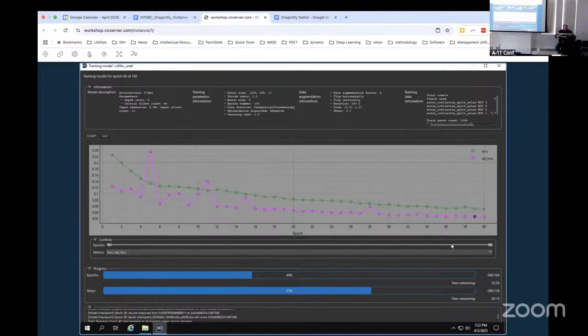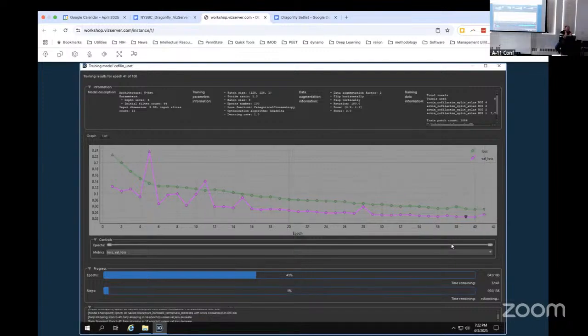Yeah, it's hard. The only time I ever close in the missing wedge is with our vesicles. Sometimes we'll close in a whole vesicle because it trains well enough to somehow distinguish the top edge of a vesicle, but it still misses the tops and bottoms of microtubules a lot, and things where the missing wedge is. I've only tried icing it and I haven't been able to find parameters that work, because there are two layers, so it will start joining the two layers together before it fills in the missing wedge, making an artifact that I don't want.